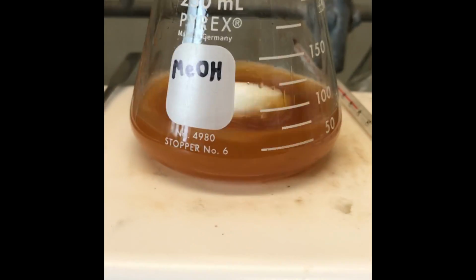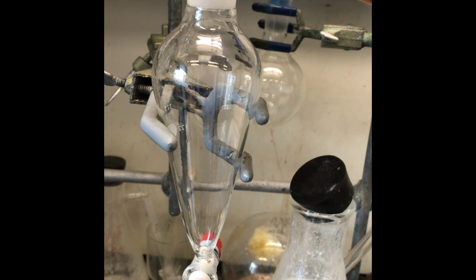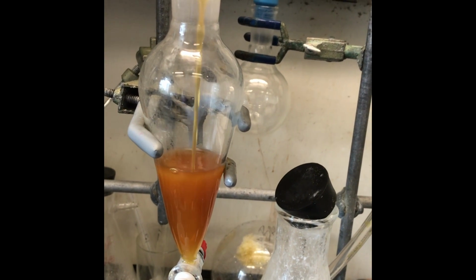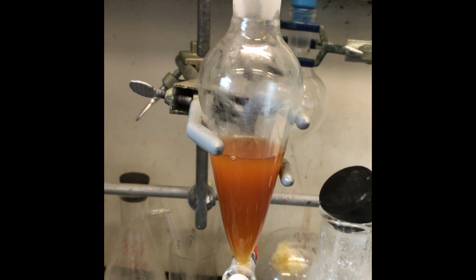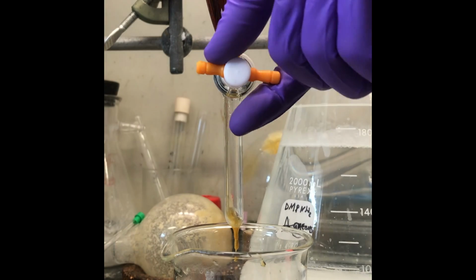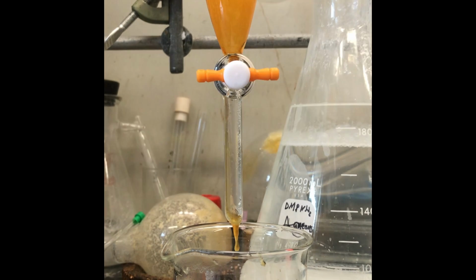30 minutes later, the biodiesel is ready to be isolated and purified. The mixture is added to a separatory funnel to separate glycerin from the biodiesel product. The 2 layers are allowed to sit in the separatory funnel for some time, so 2 distinct layers are formed: the biodiesel on top and the glycerin on bottom. The glycerin layer is then discarded.